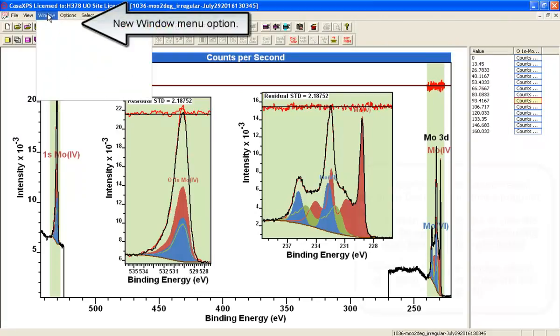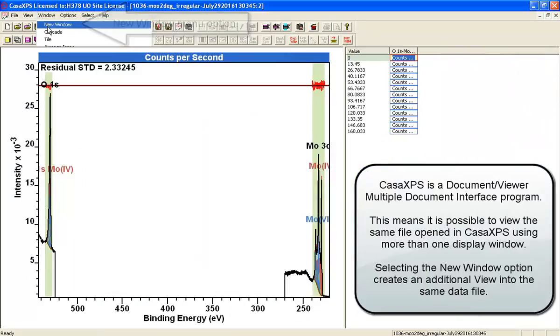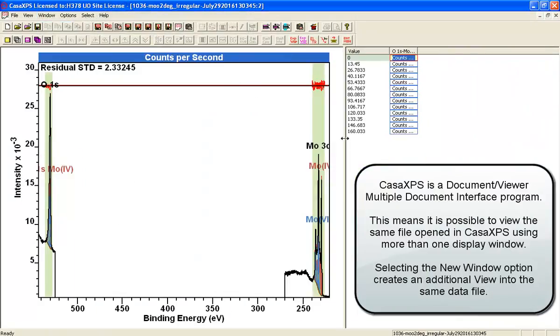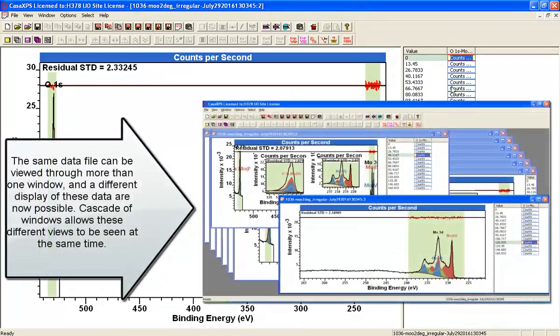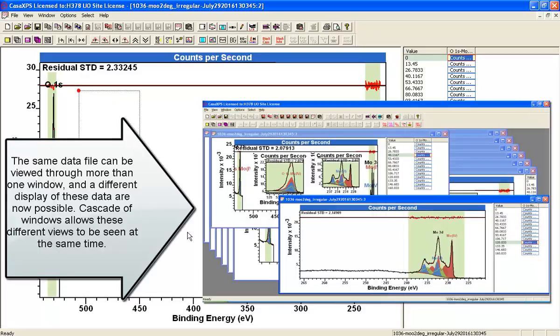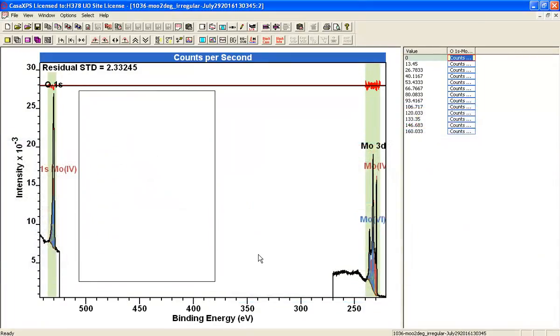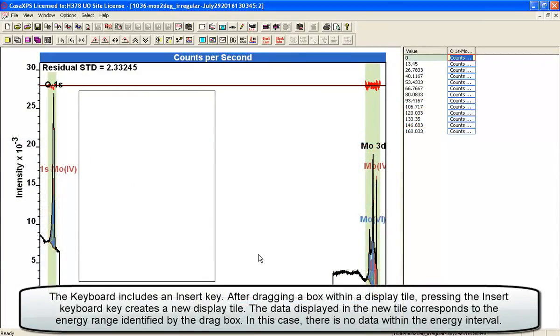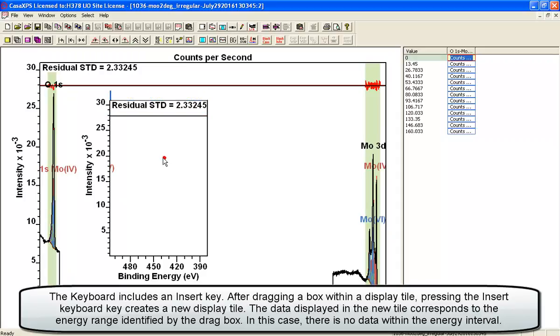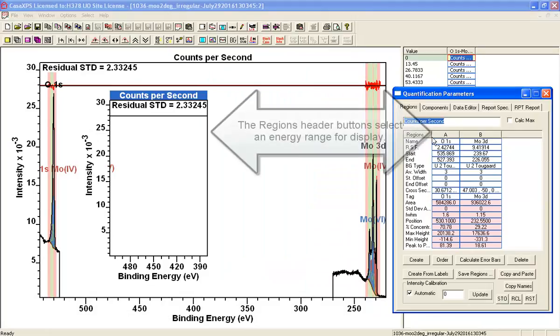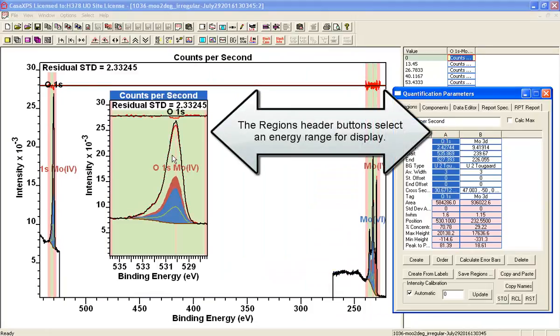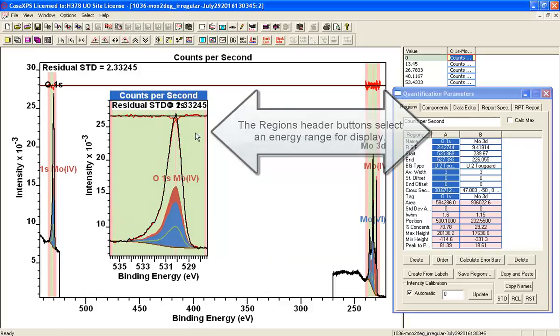How do I do this? Create a new window — a new window means that I've got a different view of the same data. We're looking at the same data file here just through a different view. The way to create these insert tiles is to drag out a box, press the insert keyboard button, and then bring up the quantification parameters. Because I've got regions defined, if I click where it says oxygen 1S, it zooms into that oxygen 1S.